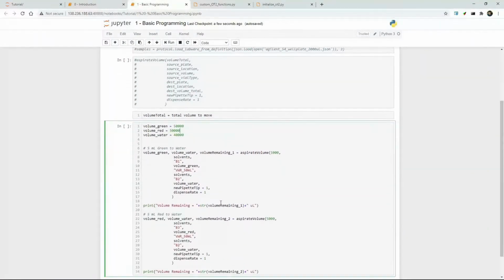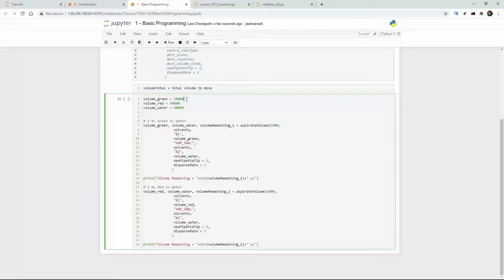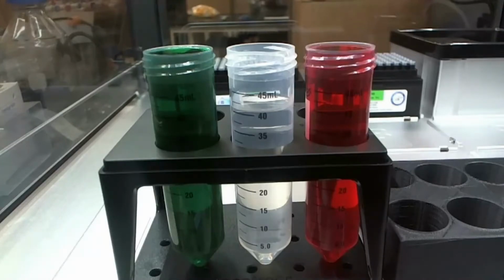Okay. All we need to do is run this down here. With this cell selected, I'm going to hit run. But before I do that, I'm going to switch back over to this, and we're going to watch it and see what happens. And hopefully I know what I'm doing. So hit run in 3, 2, 1, run.